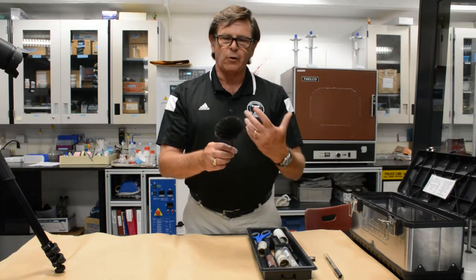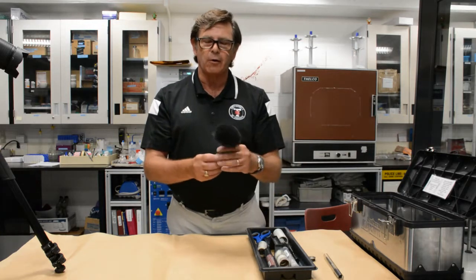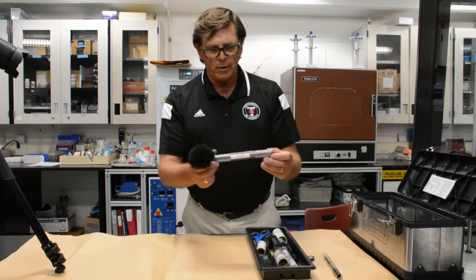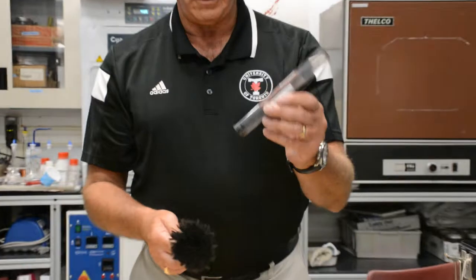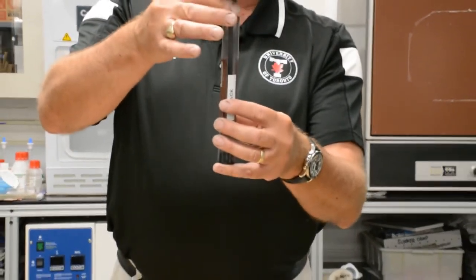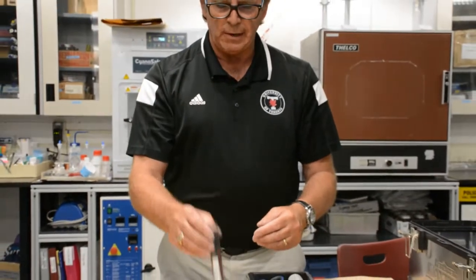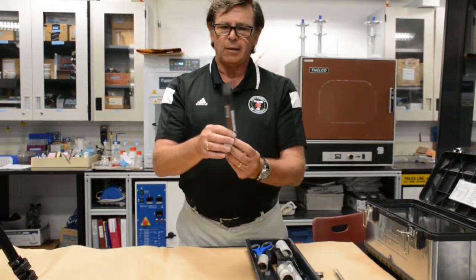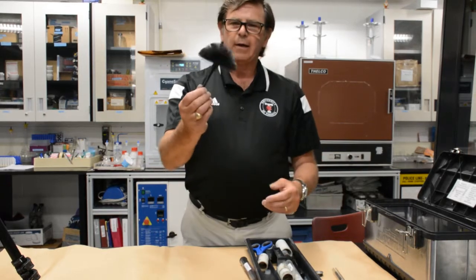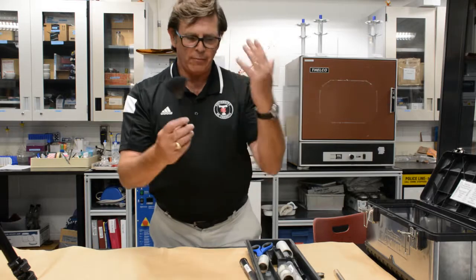When the brushes are all new, they are all white filaments. They simply get stained with whichever color fingerprint powder they are dedicated to use with. Each one of these is labeled accordingly, as are the cases that they go in. To insert it back into its sleeve, simply drop it into the open end and tap it a couple of times on the counter, and it will slide back in. Likewise, when removing it, just bring it out like that. Give it a little bit of a twirl and it fans out the filaments.